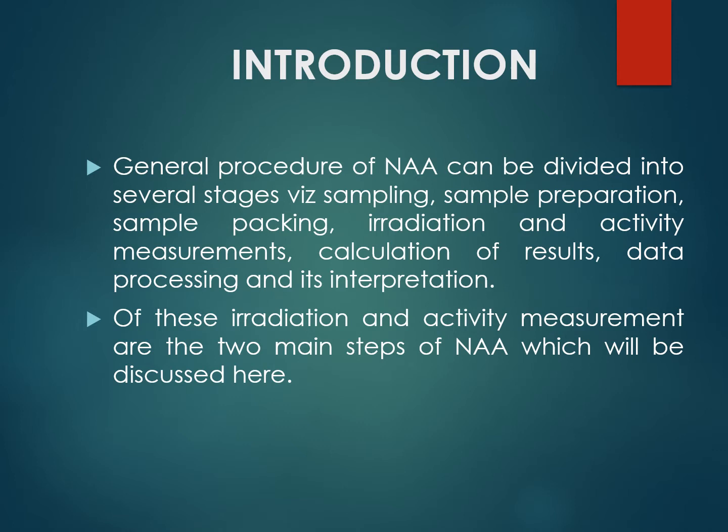Sampling is a technique in which the species of interest, or the substance or the quality of any sample that we want to determine, is first of all collected by using different methods. Then that sample which is to be analyzed is passed through different sampling procedures, which is known as the sample preparation, and then that sample is packed using sample packing techniques.